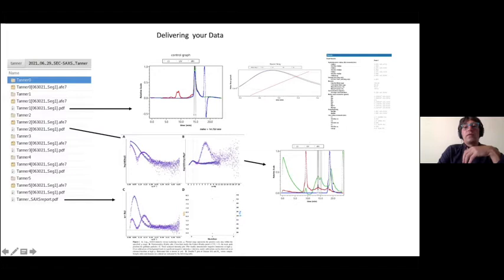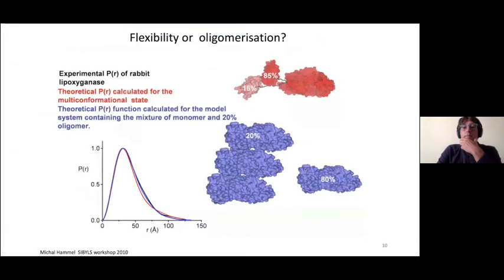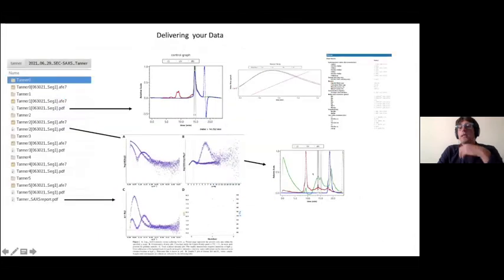And obviously, if you see something like this, oops, then you cannot expect anything from this sample. You see there is just aggregation, and the UV signal for the actual sample is just not existent. Versus this, even though a pretty small amount of aggregation is detected, you can separate the aggregation into a kind of front peak here, and then you have the main peak on the side that you can analyze, and you can get decent signals. You can see this dark blue is coming from this peak.